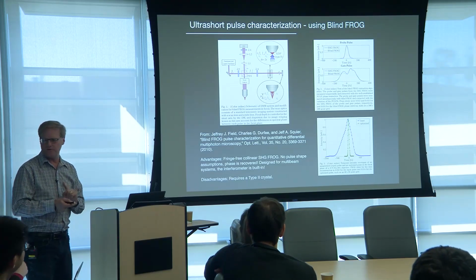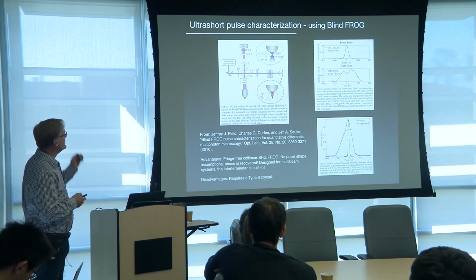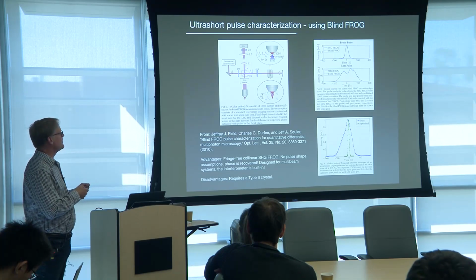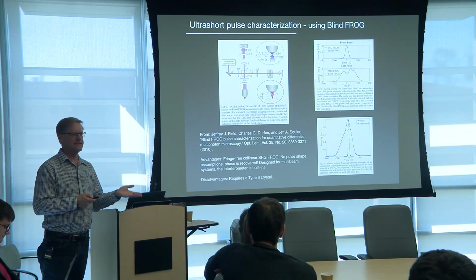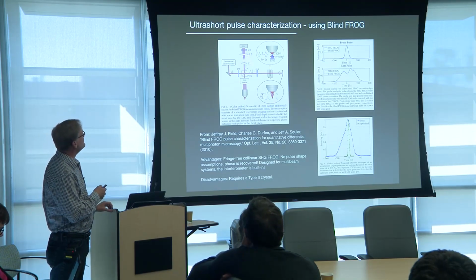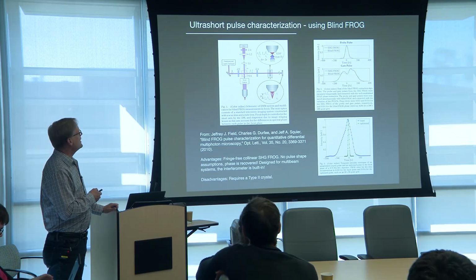We switch to photon counting, and we can do multiple depth imaging, et cetera. But what we realized is as soon as we've gone to a multiple beam system, you've got your interferometer built into your system. So what we did is say, okay, this arm was made longer than this arm.